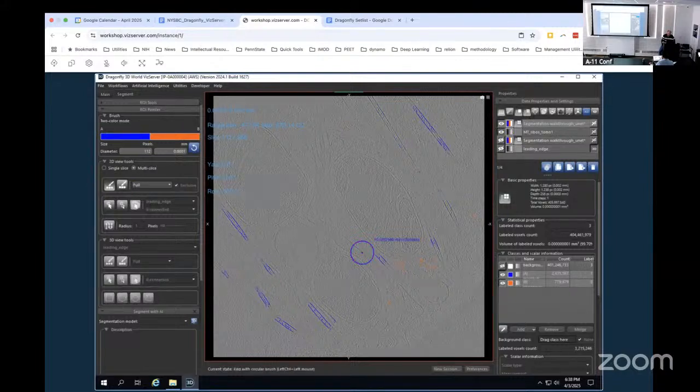And if I hold control, it'll give me a blue brush. And it will only act on things that have already been segmented. So say, for instance, this microtubule really was a ribosome. That doesn't make sense, but you could just scroll over it and swap the class. So when we're retraining, every time the network misclassifies things, this tool lets you go in and reclaim that territory into the right class.